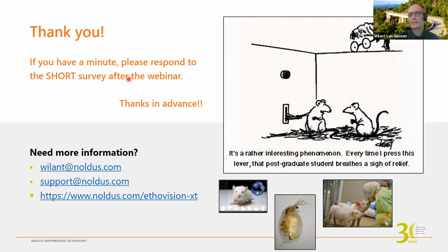Jason, anything to add to that? It says, yes, that's what I tried, but it keeps updating the settings. You know what? Let's talk about that. Feel free to contact support, and we can talk about your specific settings, because I'm curious to learn what's going on in that case. Agreed.